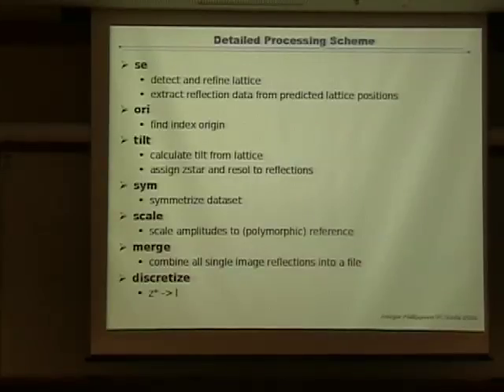Are you talking about image? About diffraction processing. Okay. Then we calculate the tilt from the lattice and thereby can assign Z star and the resolution to all the reflections.